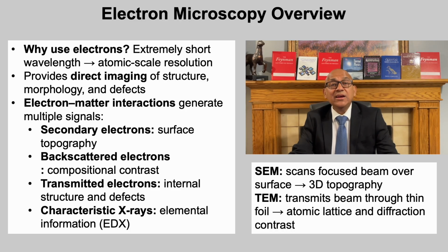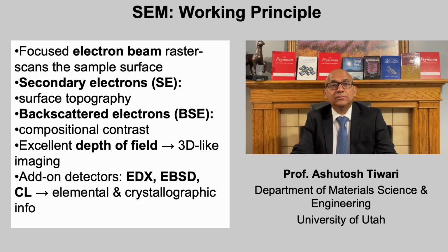By combining SEM and TEM, we obtain a continuous imaging hierarchy, from micrometer scale grains to atomic scale defects, making electron microscopy the workhorse of modern nanoscience.